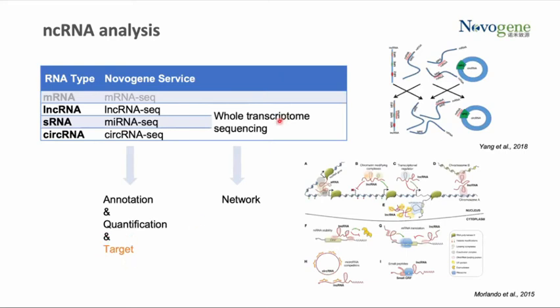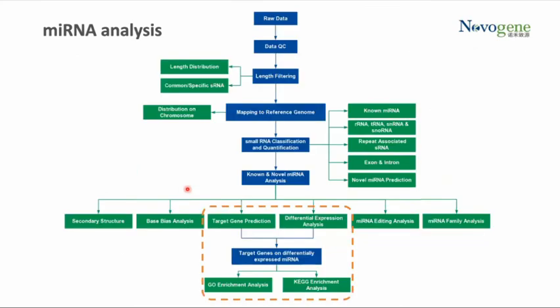And for the whole transcriptome sequencing, we focus on the network study between multiple types of RNAs. Here, I just listed the microRNA analysis pipeline as a demo. And you can see on the bottom, we include the target prediction and further analysis.